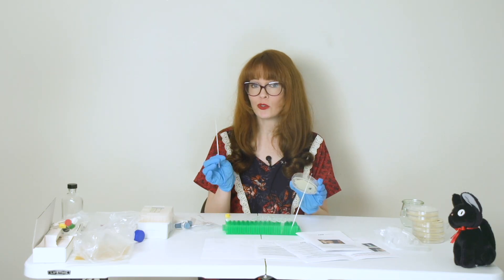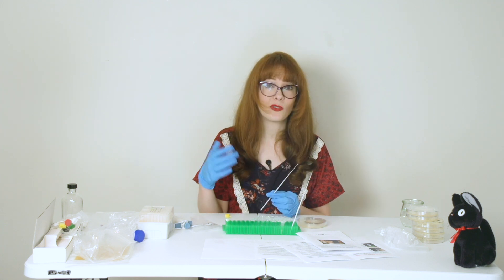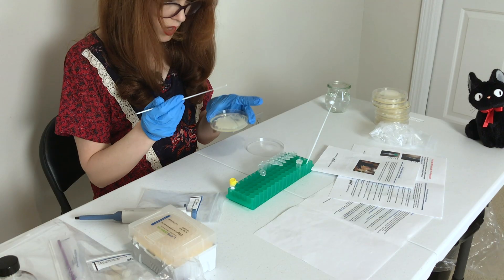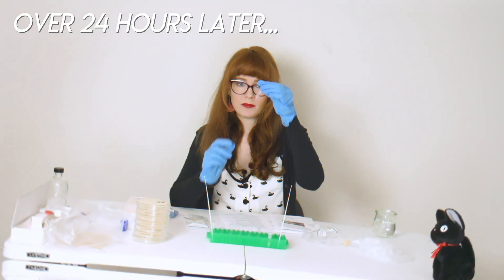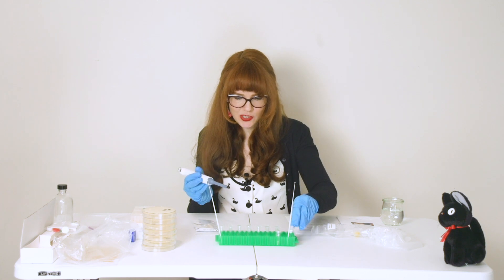I'm going to take about two loopfuls of yeast and add it to my transformation mix. I can also use the pipette to pipette it back and forth — is pipette a verb? This should be the competent cell mixture. I'm going to add the DNA to my competent cell mixture.